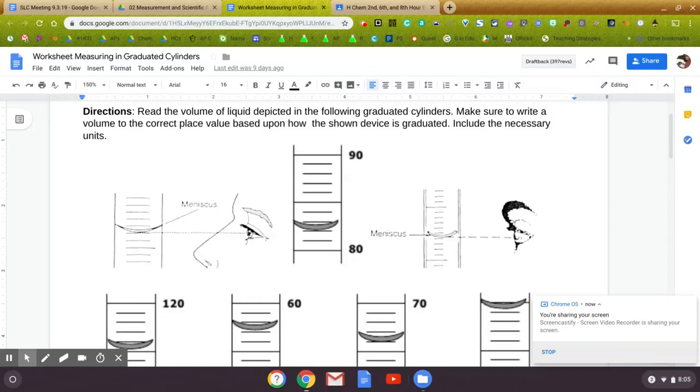All right, so we've already talked a bit about how significant figures only apply to measured values. For most of what we do in our actual chem class, we're measuring off of graduated cylinders. We do, however, use balances, which of course have measured values as well. You just don't have to actively measure. The digital readout tells you the actual number. And then we do use rulers and calipers sometimes, but for the most part, we're measuring in graduated cylinders. So being able to read a graduated cylinder appropriately is really important to us.